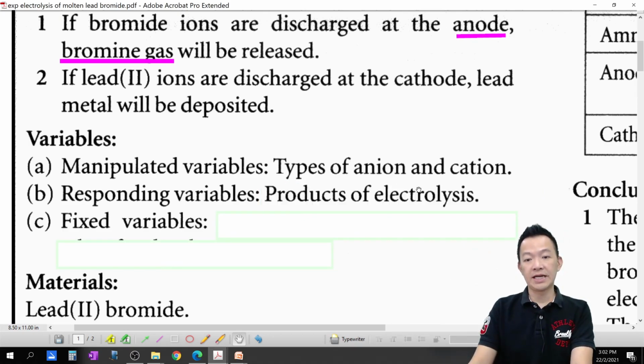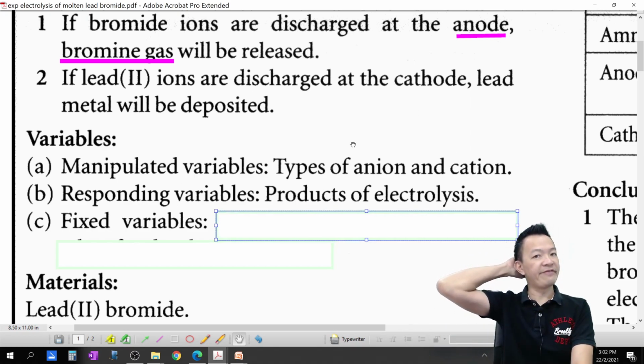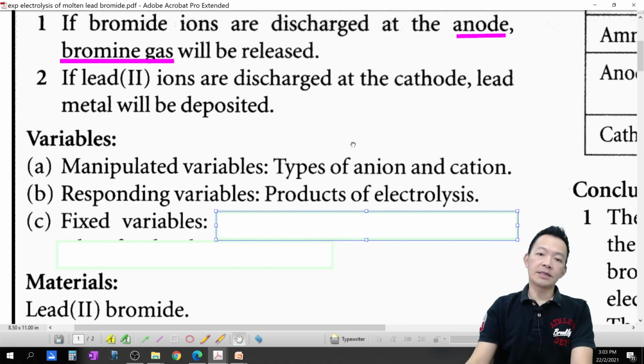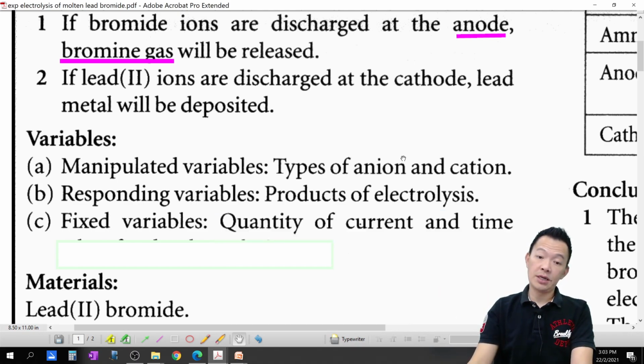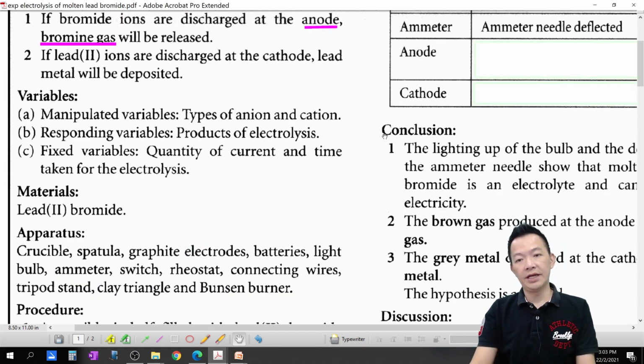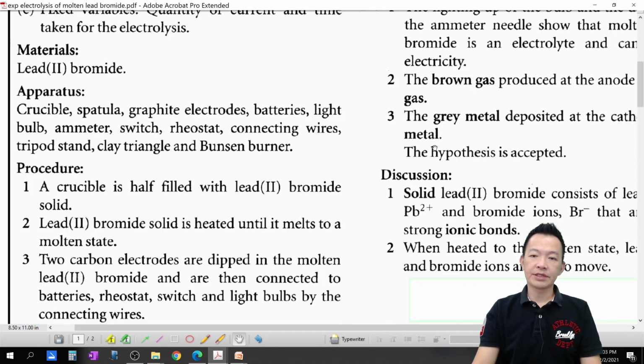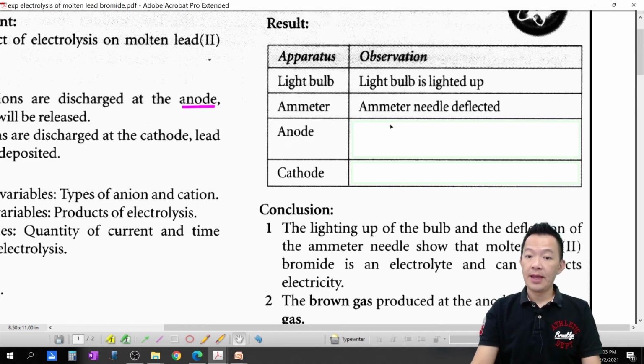Electrode 拿到的 product 是什么？我的 electrolysis product 电解法拿到的 product 是什么？Fixed variable 固定性变数。In this experiment, what must be fixed? Electric current 啊，你用的电流，对不对？So the quantity of the current and the time 还有你的时间哦，so 不是很重要的变数来的啦。So how is your observation？你的观察是什么呢？Anode, what is your observation at the anode?